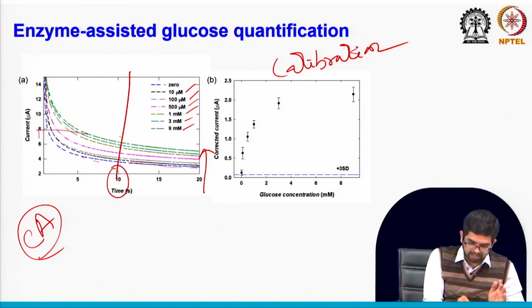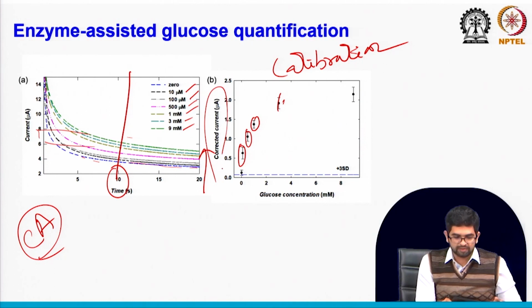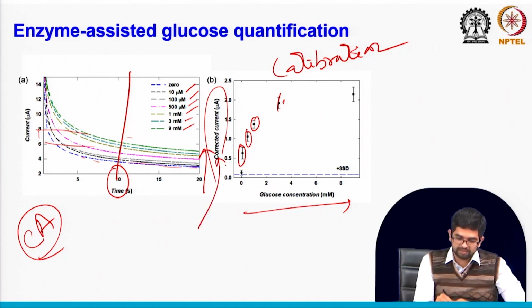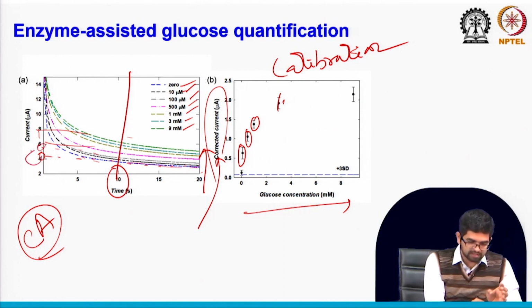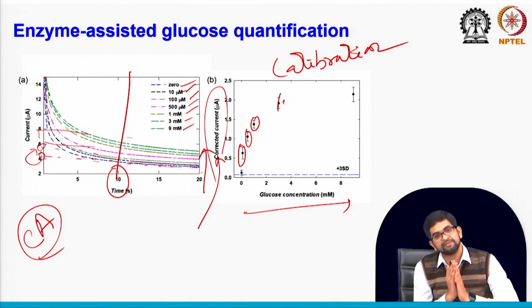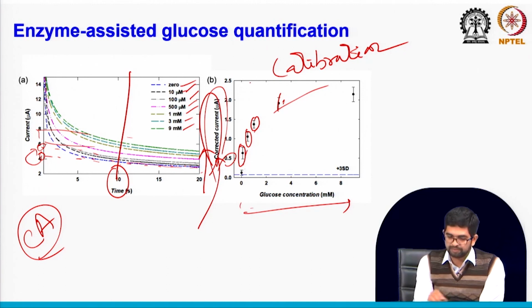In this time you can measure the current for each concentration, and for each concentration you have to measure 3 times. See, this is the error bar for 3 data points. For the different concentrations of glucose on the x axis, the y axis is the current. And why am I saying corrected current here? Because we are subtracting the zero data. Suppose you are getting this much zero data, and your 10 micromolar data is this much. If you subtract the zero current from the 10 micromolar current, then you get how much current you actually have for the 10 micromolar. We plot all the corrected currents for all the concentrations, and then we got the calibration curve.